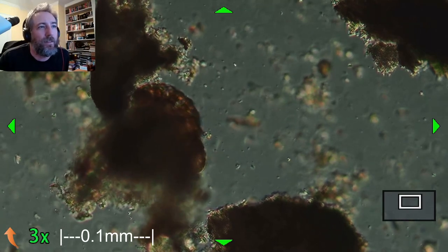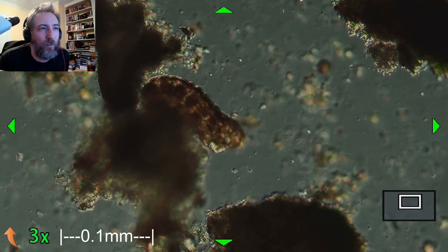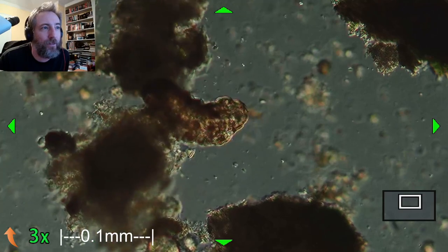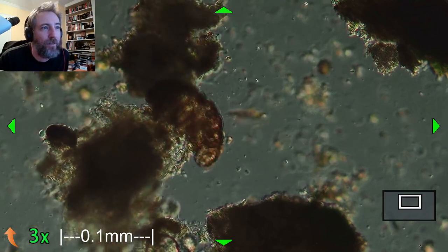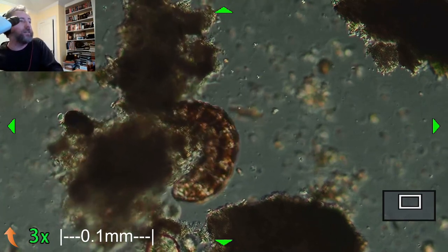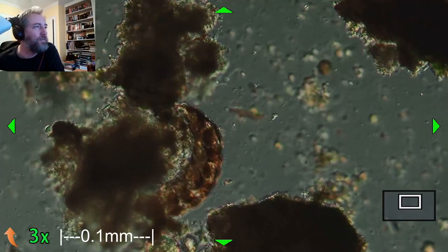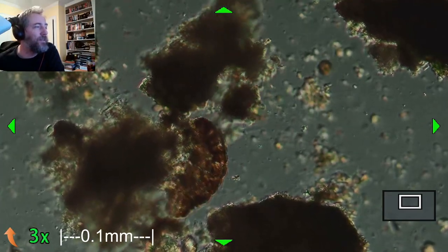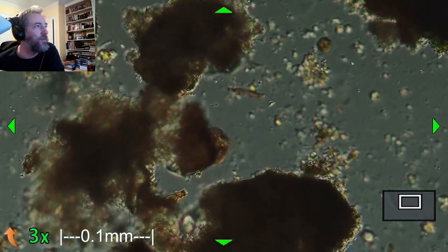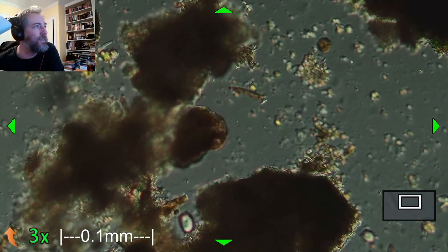The skinny of it is I bought a red, green, blue, white emitter because I thought it would be interesting to view subjects in different wavelengths, but if you think that's a bad idea, I may just ditch the emitter and go with white. I don't know. It depends on what you're looking at. But a lot of times the different colors can show you some things that you wouldn't normally see, or highlight certain things.